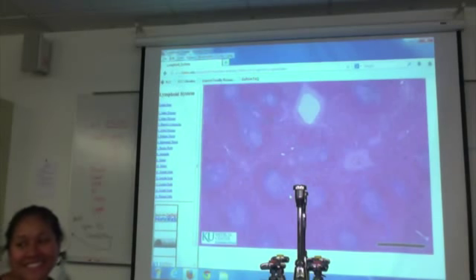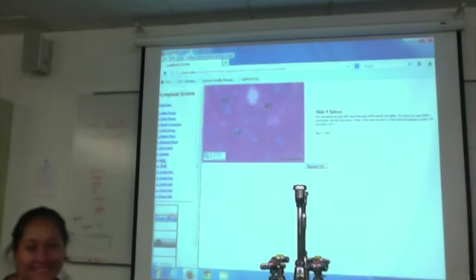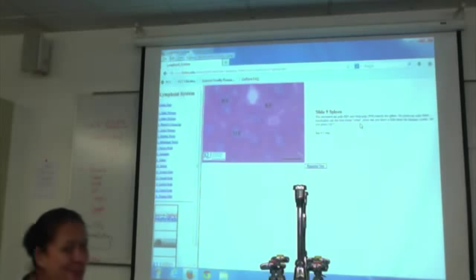Just think the opposite, then you have biology. Think of a white blood cell, right? They're purple. That's the same logic here. But they're both follicles. White pulp is WP, the dark things are white. No, you're not colorblind. That's what it says. It's all just called the blue tissue white. But that's all how it gets stained. We name things by how it looks, not what it is. So it gets stained dark, whatever.